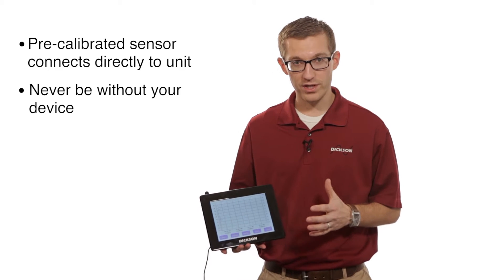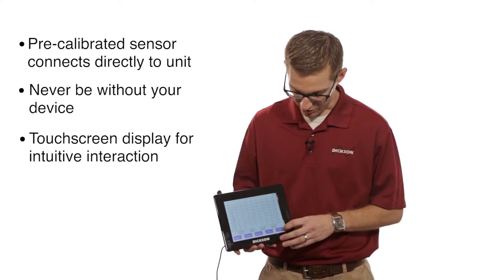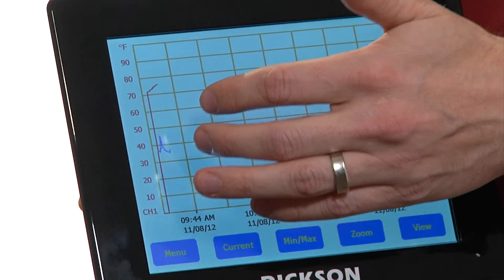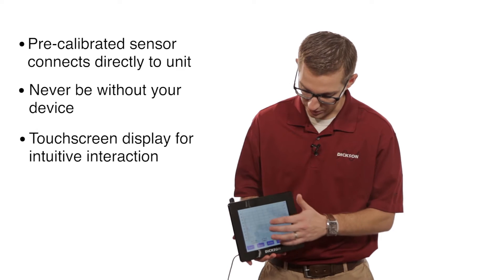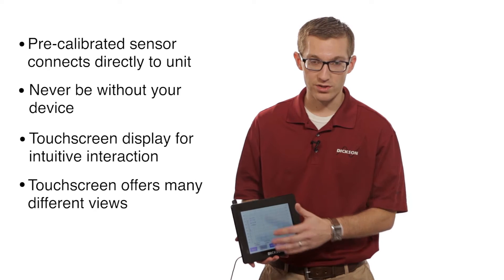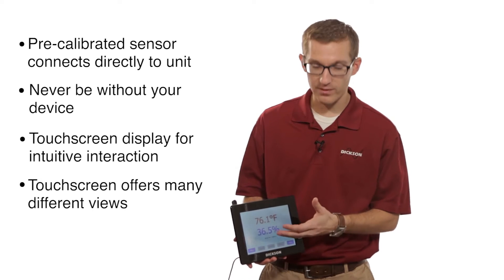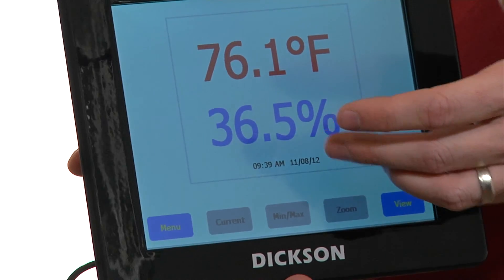A couple of other cool features on this unit are the display itself. It is a touchscreen, completely interactive. As you can see right here, we're logging both temperature and humidity information on the unit. You have a couple of different views: just the graph itself, then the current values in a digital format, and then a big digital display which shows you your current temperature and humidity percentage.